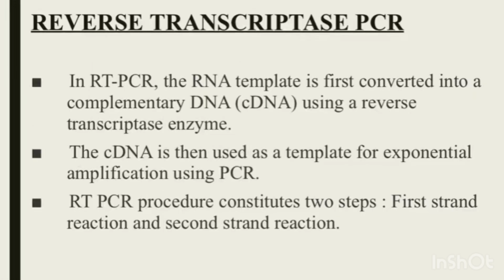So coming to next type of PCR is reverse transcriptase PCR, which is also called RT-PCR, in which RNA template is first converted to cDNA using a reverse transcriptase enzyme. Then this cDNA is used as a template for the amplification using PCR.